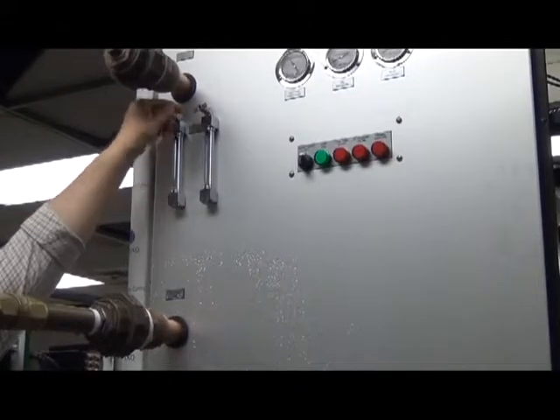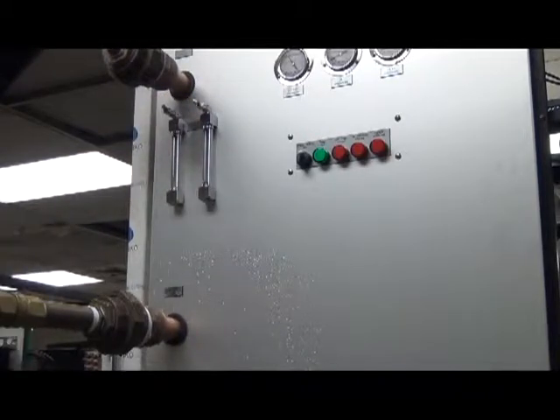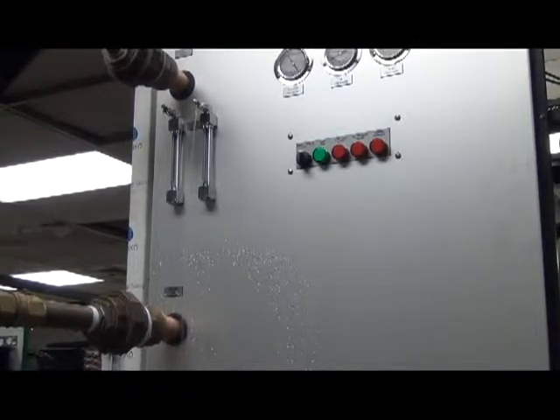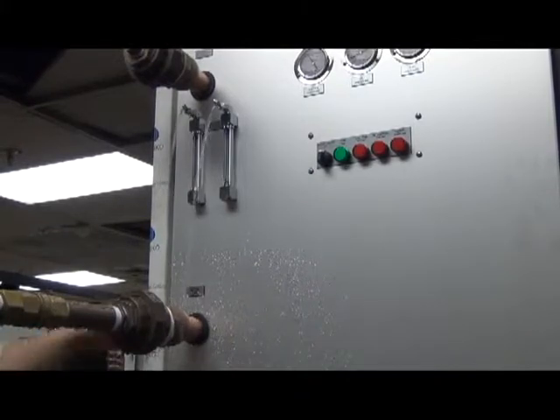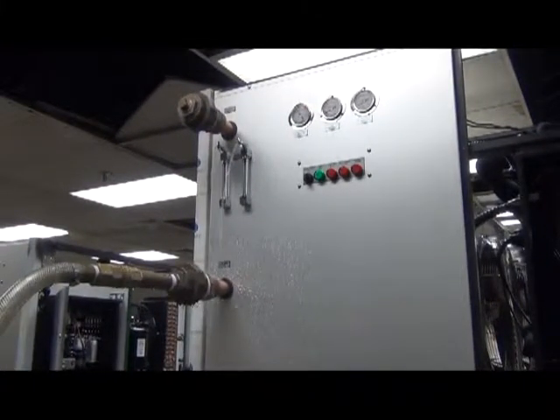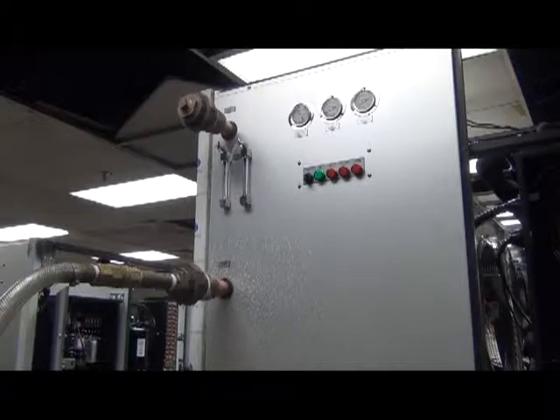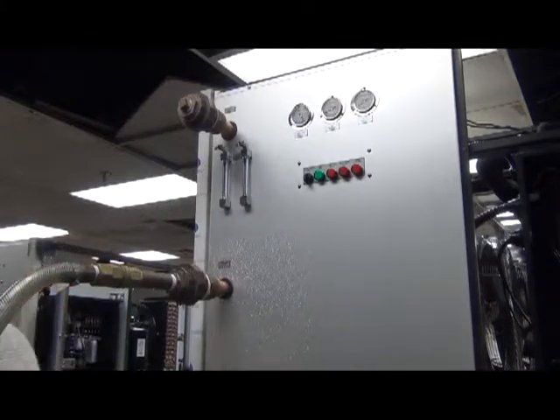Before you begin filling the chiller, you want to open these about a quarter of a turn. That will release any air that's in the system as it's being filled. And then you want to open your water supply and begin filling the chiller. And when you get water coming from the air vents, you'll have some air coming out as well. You want to make sure that all the air gets out. And then you can close these and turn off your water supply.